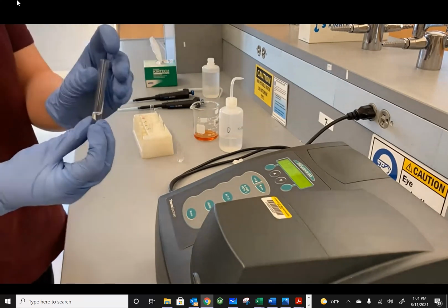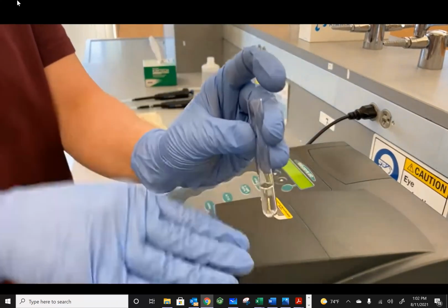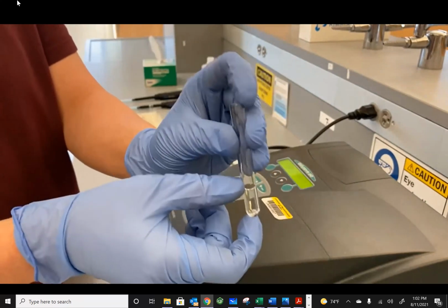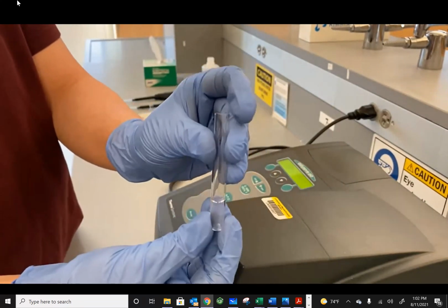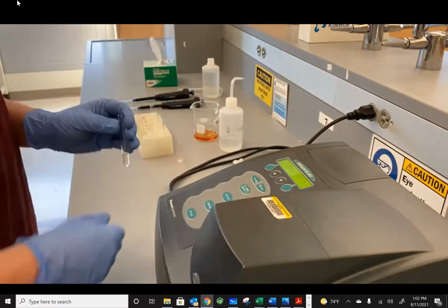But to do that, we keep our metal, not the complex, just the metal, which is this clear liquid here, in a standard amount of 1,000 microliters. Now, as you can see, before we add the ligand, it is clear. It looks pretty much just like water.